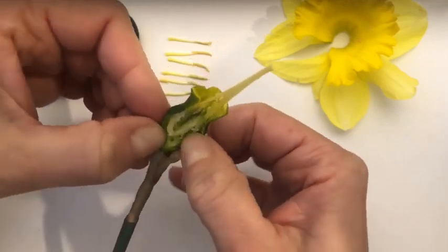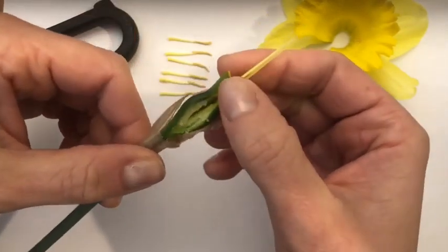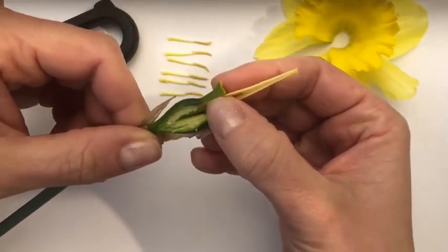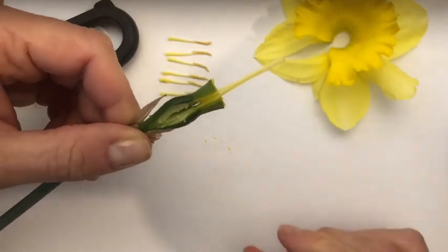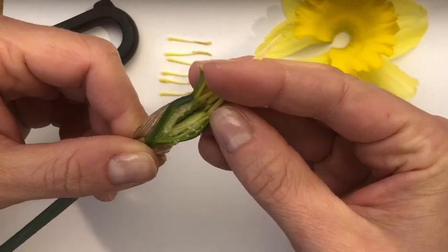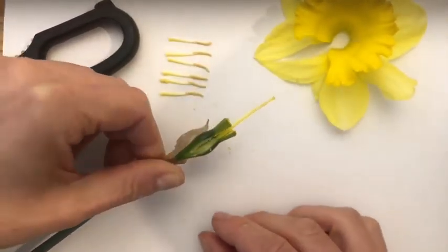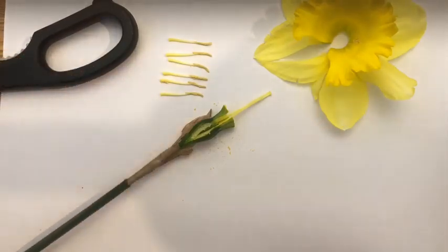The seeds in daffodils take a long time to mature and grow into new daffodils, so we actually usually buy daffodils as bulbs and plant them in the ground. But you can see here the different parts of a daffodil, and I hope you enjoyed dissecting in our virtual lab today.